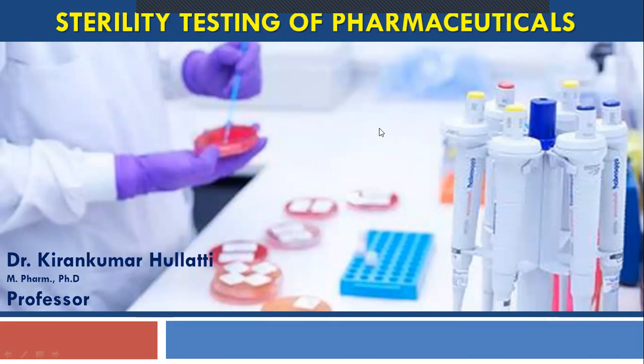In such cases, if such products are contaminated with any pathogenic microorganisms, that will lead to a disease condition in the patient. The patient who is consuming the medicine for the sake of recovering or fighting back against infections will in fact get more infected with some pathogenic or deadly microorganisms. So that is the reason.